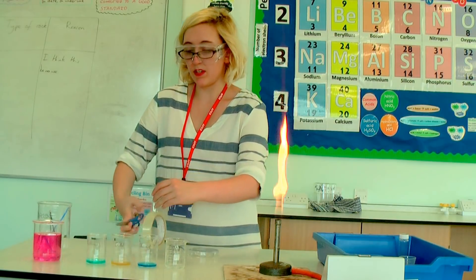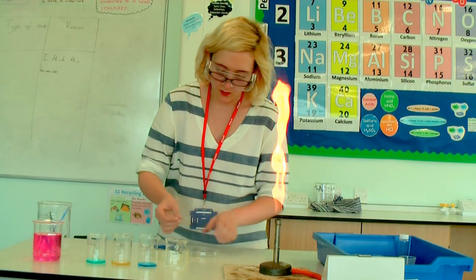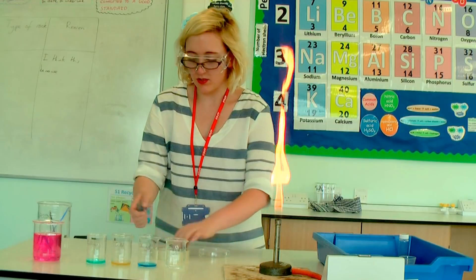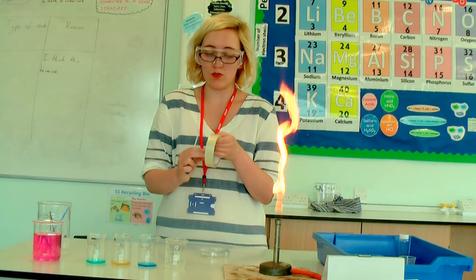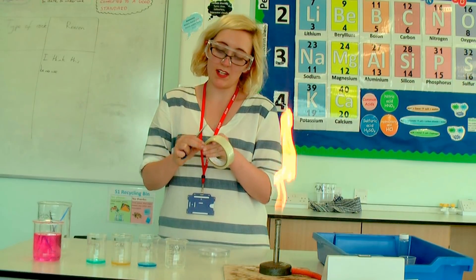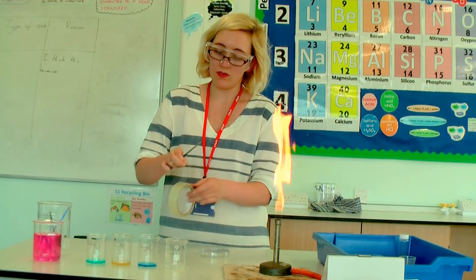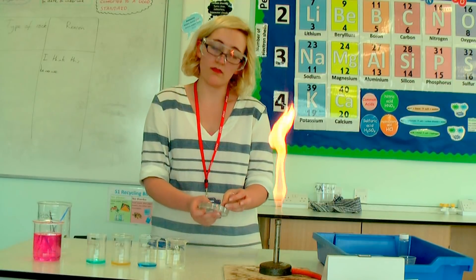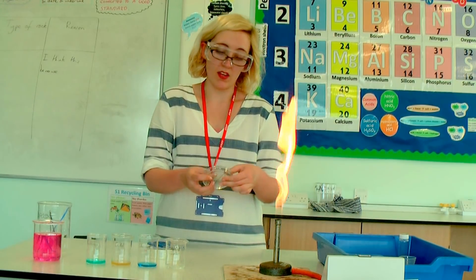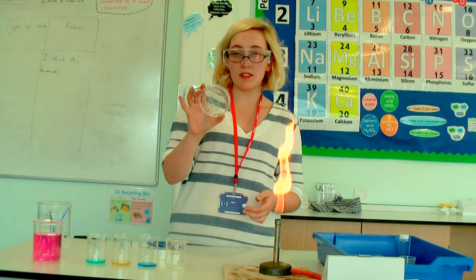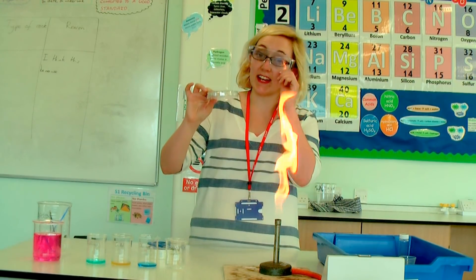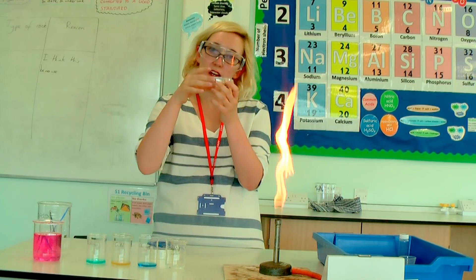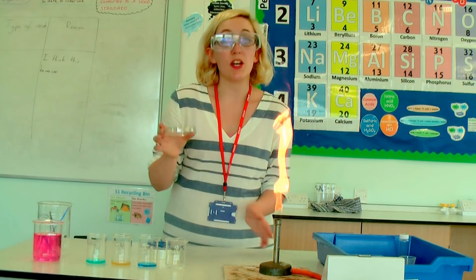When I pick it up I know it's sealed, I know I have bacteria that could be leaking out, and I know nothing harmful is going to grow hopefully. I've managed to only grow my E. coli — contamination is a key word in AQA biology; it means when a foreign bacteria or other pathogen gets in that we don't want. Once taped, leave the plate upside down — the bacteria will respire and produce water, and we don't want that water to drip onto the agar. If it's upside down, the water will drip onto the lid instead.